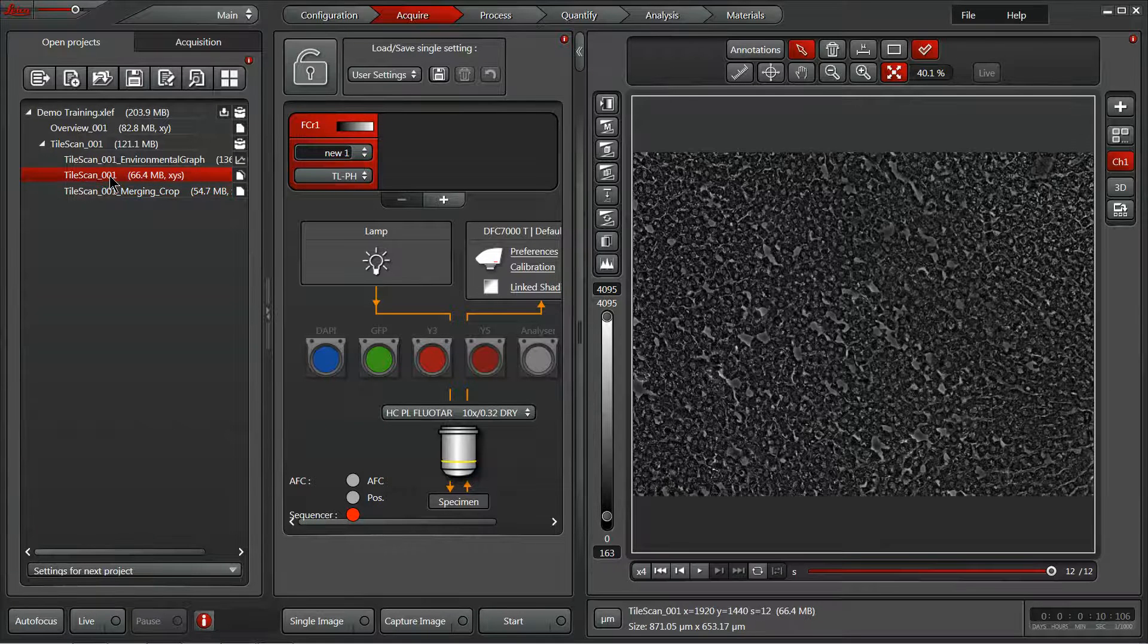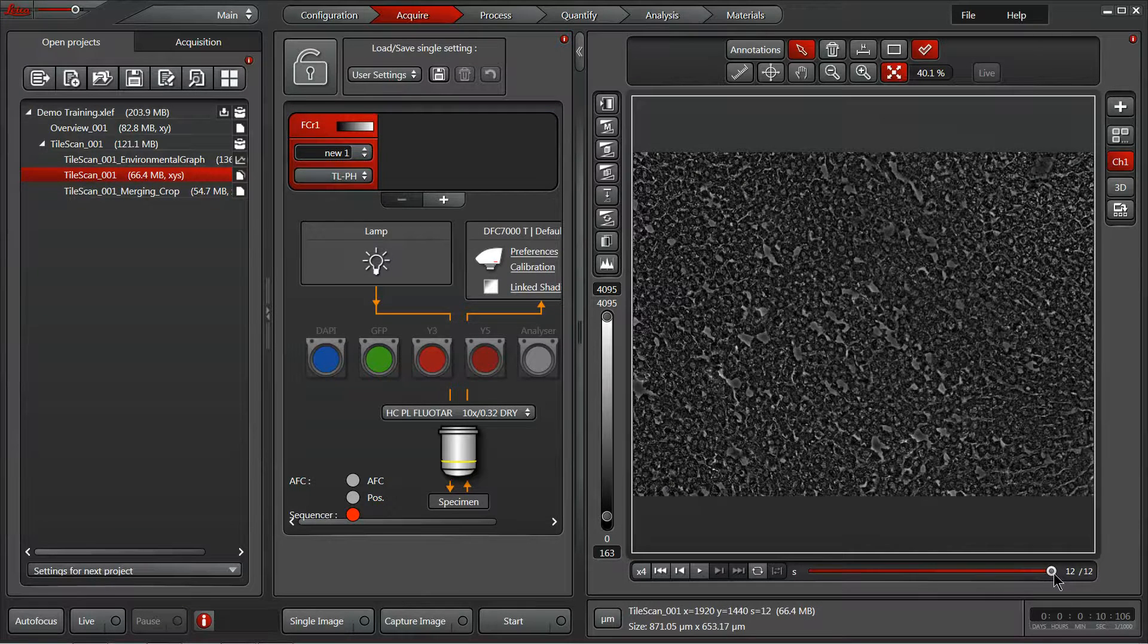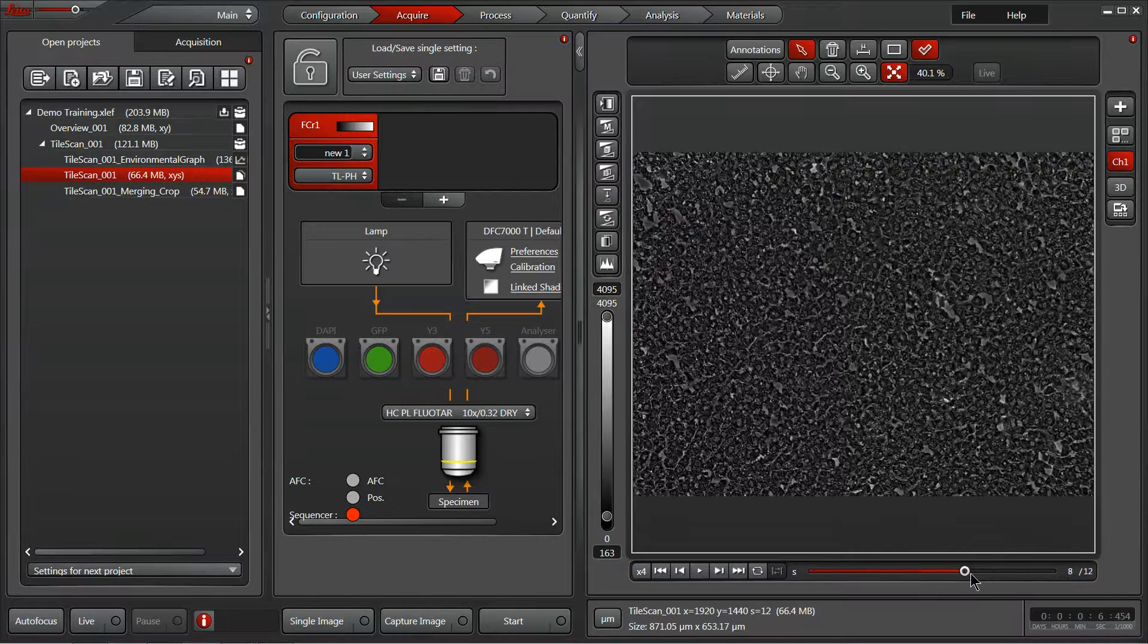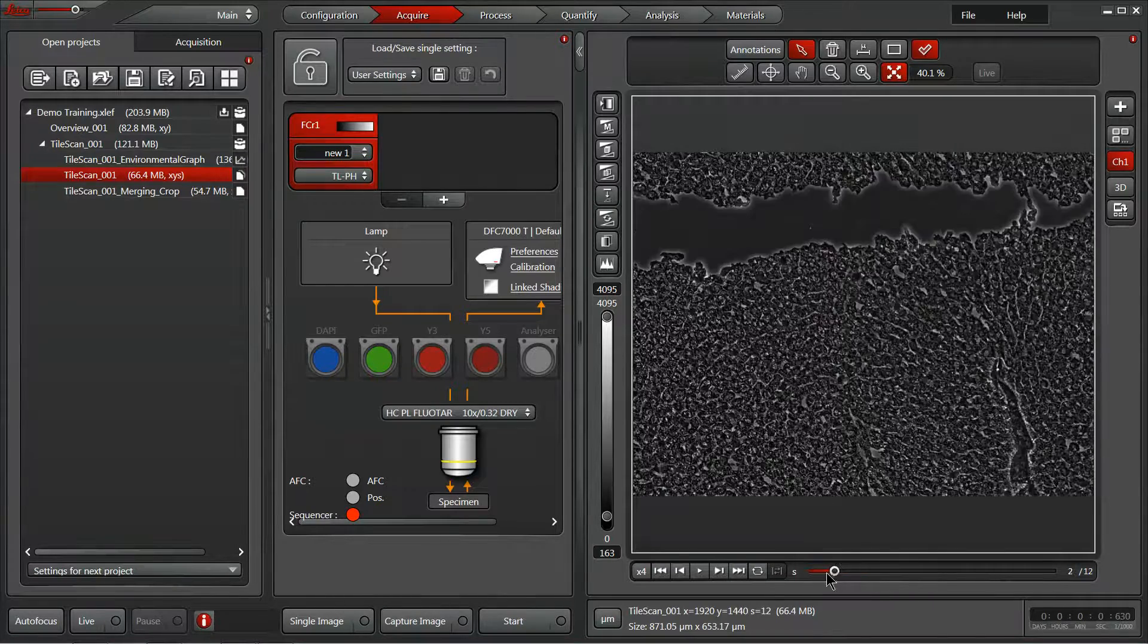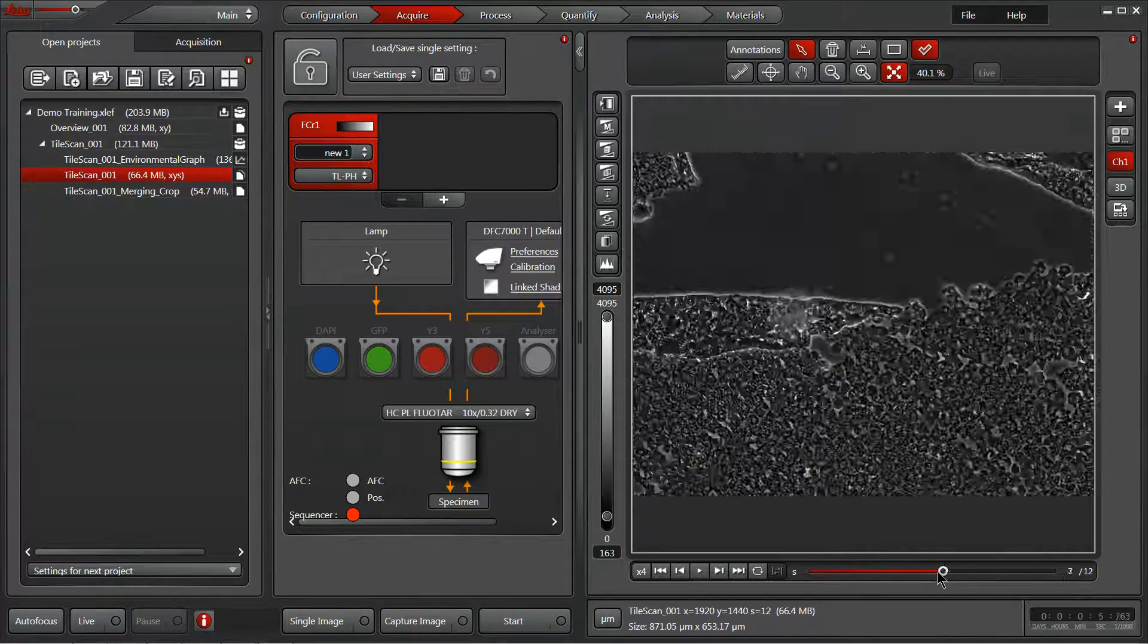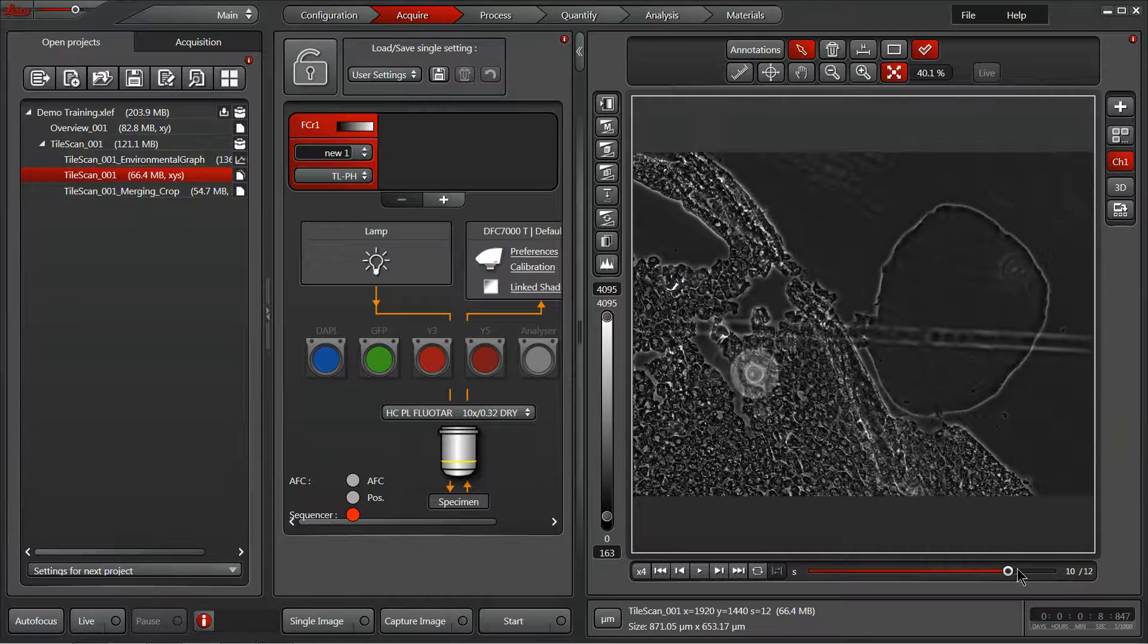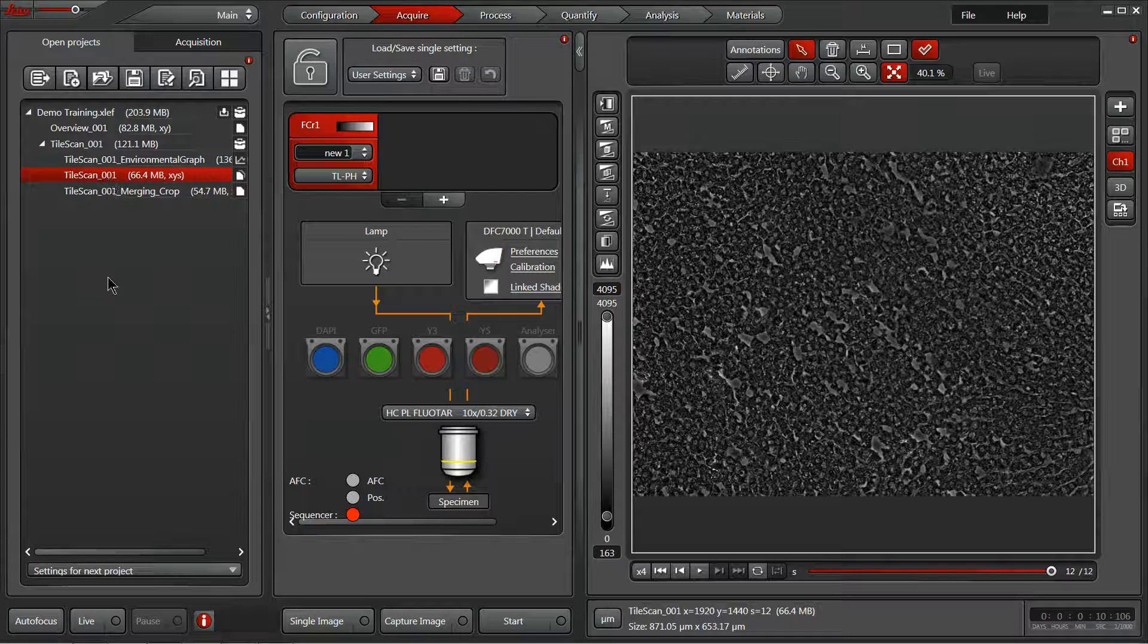We also have our tile scan with all of the individual areas. So all these stage positions here on the bottom are also saved as part of your raw data. So you can always go back and redo the merging if you'd like, or be able to isolate individual stage positions for analysis or review.